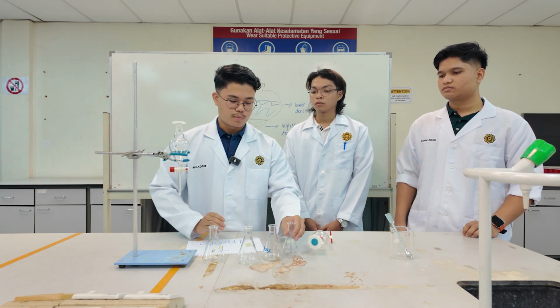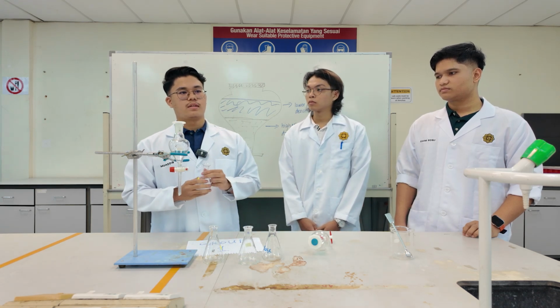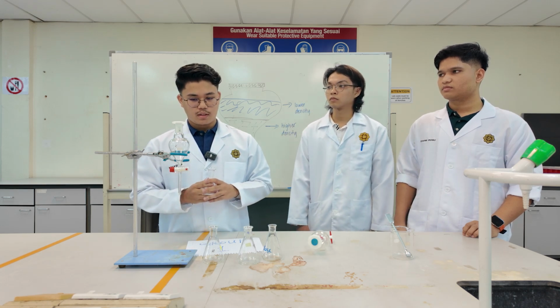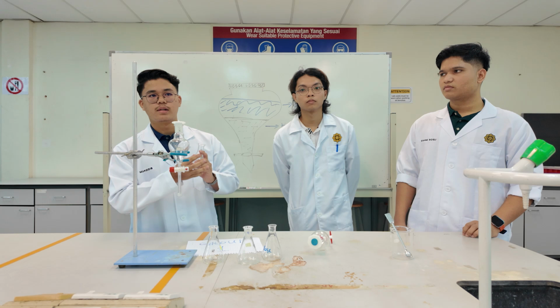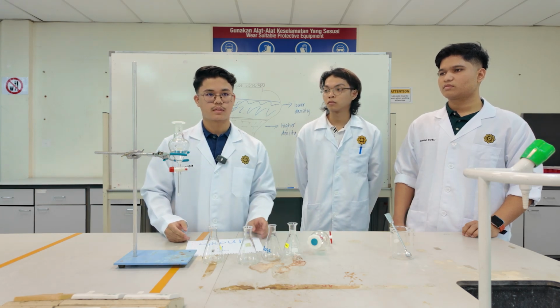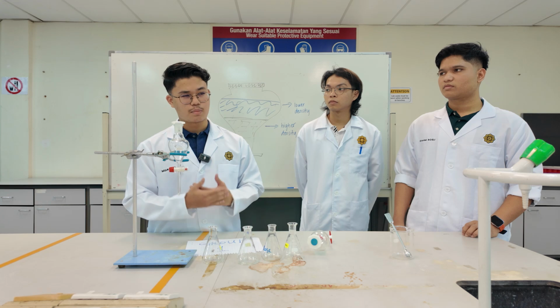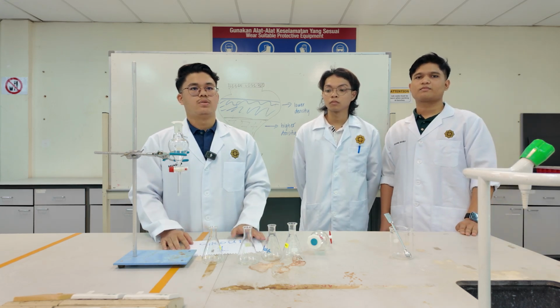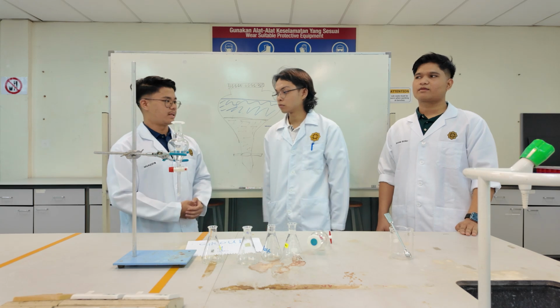But we know that this mixture still has remaining acid, so we need to do the same step to get as much acid as possible from the mixture. So I will pass next to Aziz.